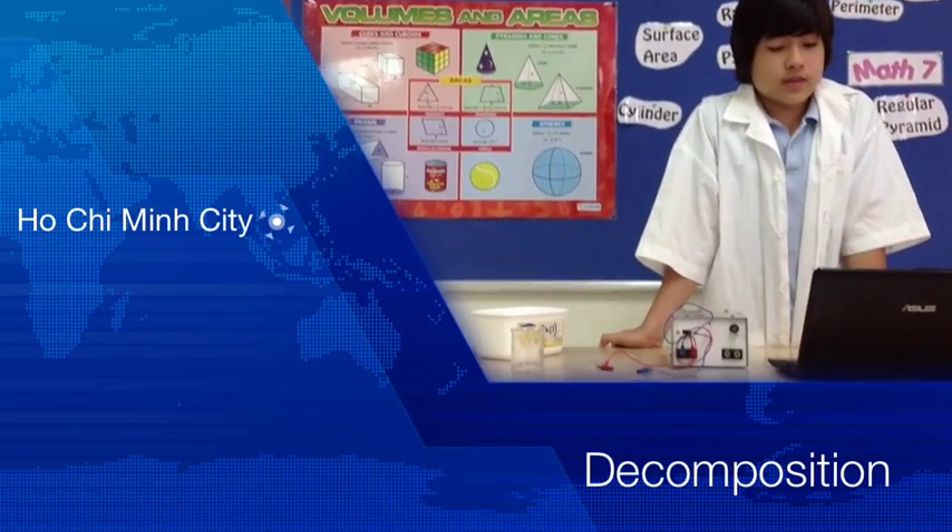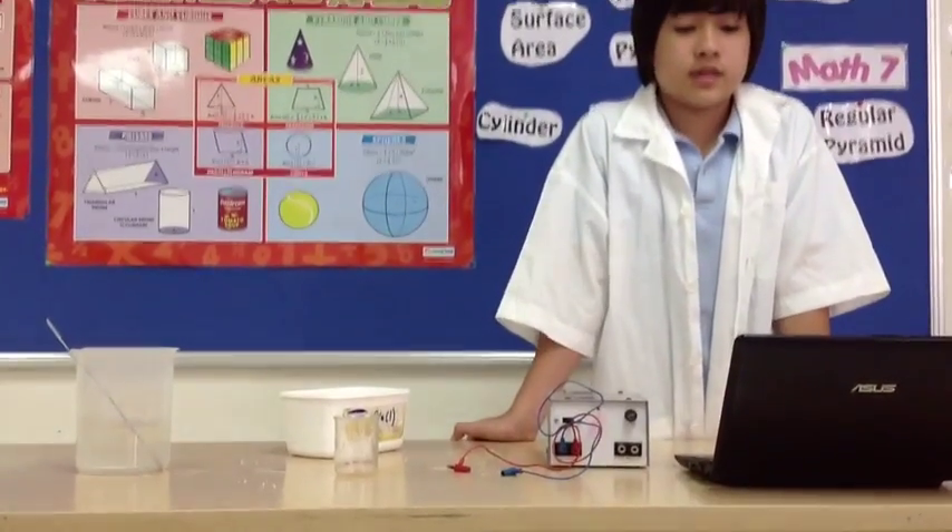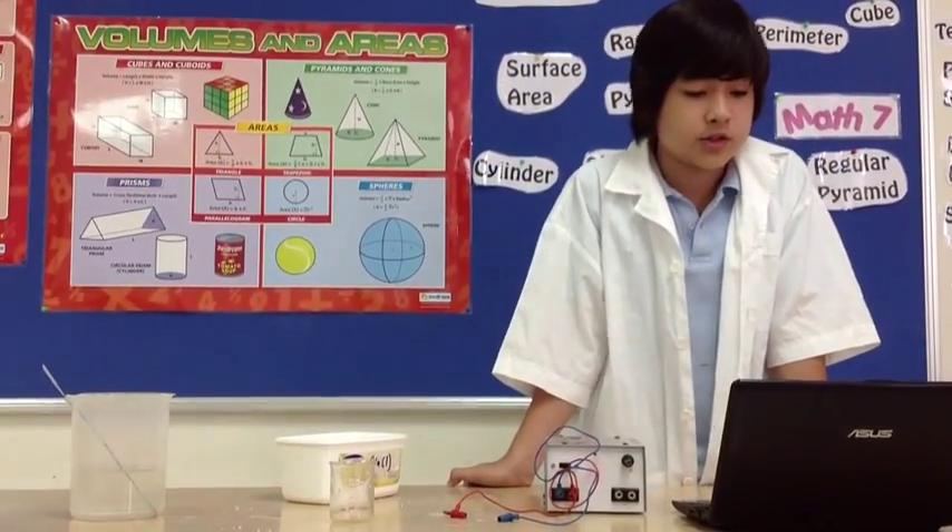Decomposition is the separation of a substance into basic elements. In this experiment, we will be separating water, also known as H2O.